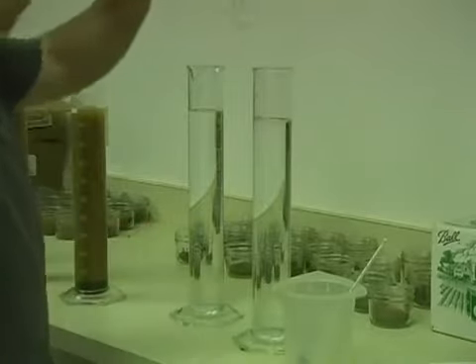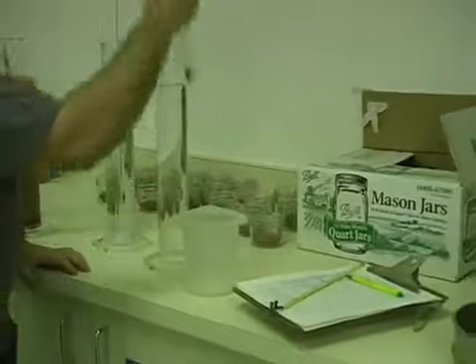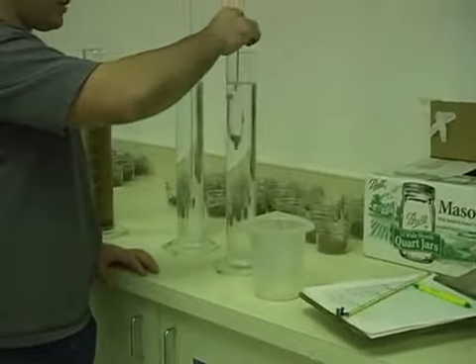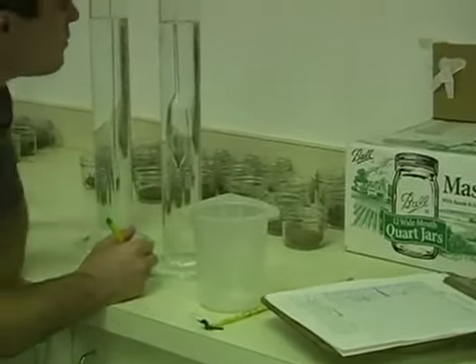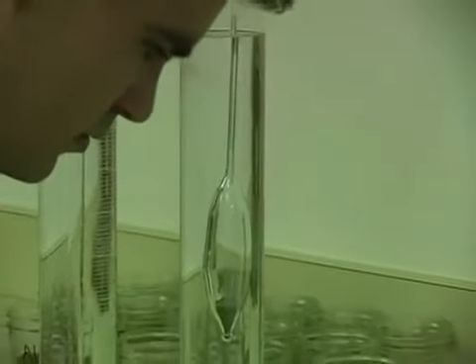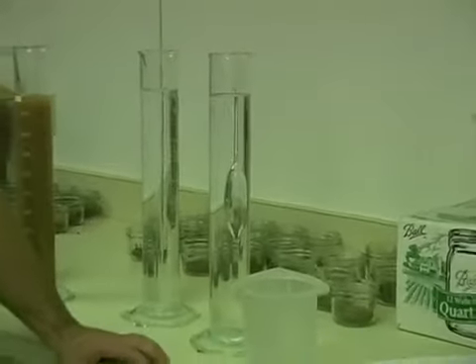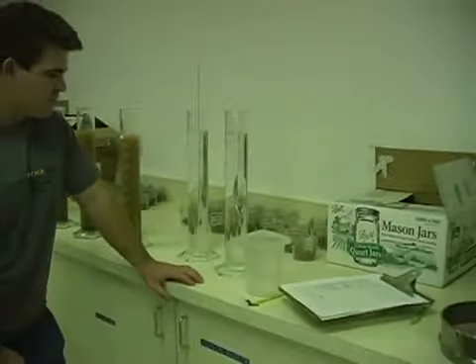And right when the plunger leaves the water, you're going to start the stopwatch, and you're going to wait for 30 seconds before you take the hydrometer reading. 5, 4, 3, 2, 1. And then hold it for the 60 seconds. Then you're going to wait another 30 seconds and take a reading at 60 seconds. 4, 3, 2, 1, go. And you're going to take a second temperature reading.